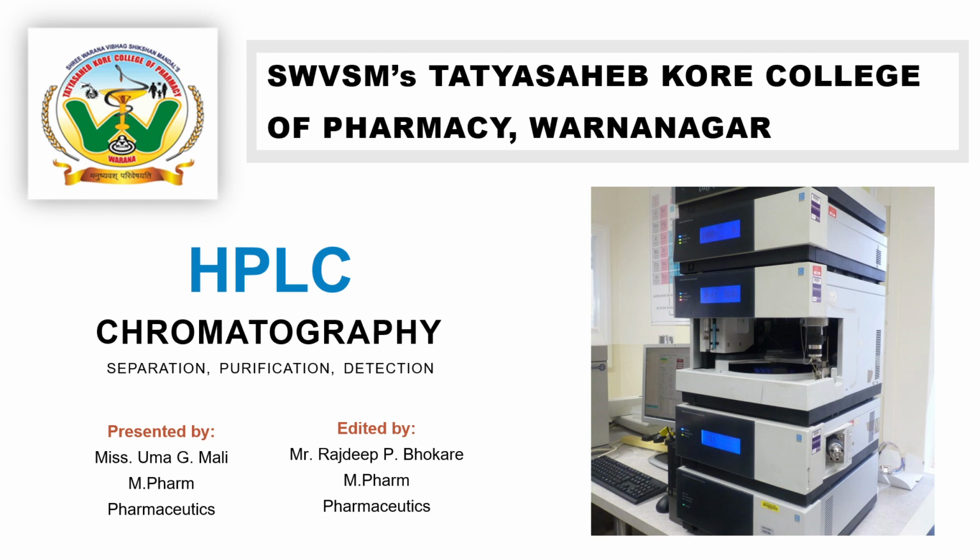Among the various technologies developed for chromatography, devices dedicated to molecular separation, called columns, and high performance pumps for delivering the solvent at a stable flow rate are some of the key components of chromatographs. As related technologies became more sophisticated, the system commonly referred to as high performance liquid chromatography simply became referred to as LC.